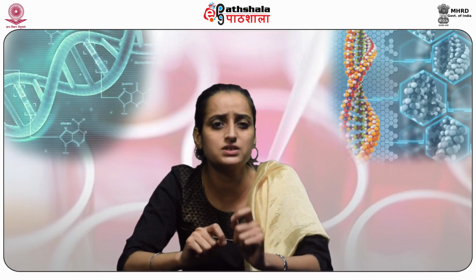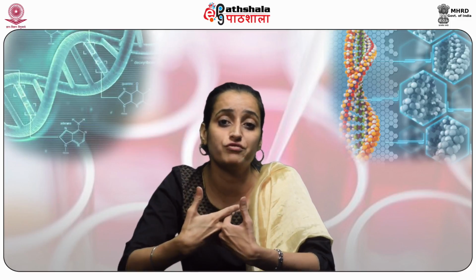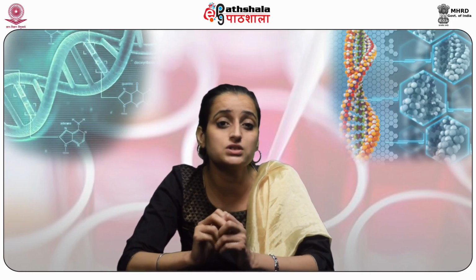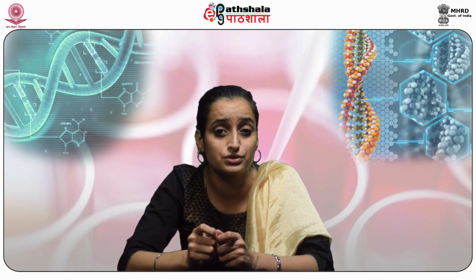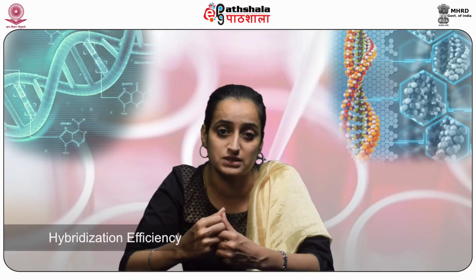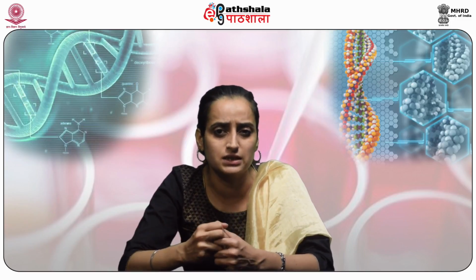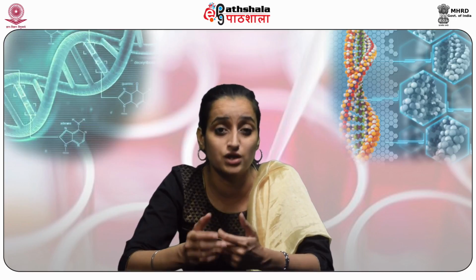This not only reduces the diffusion of probes into the tissues but also leads to cross-linkage of nucleic acids and proteins. To circumvent this problem, frozen tissues can be used. However, this leads to a compromise of morphological integrity of cells and tissues. The cellular structures and membranes impose hurdles for probe penetration and thus hybridization efficiency. Although a powerful technique, this is an expensive, labor-intensive, and time-consuming process and requires knowledge of bacterial expression, cloning, and in vitro transcription.